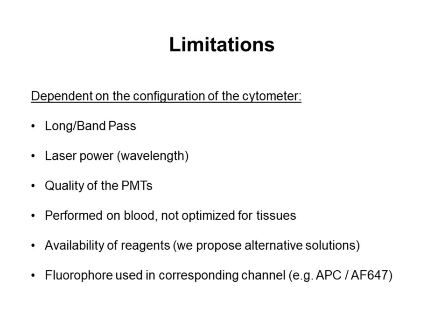So it's an advantage here. And of course, it depends on the fluorochrome you use in the corresponding channel. For instance, we use APC, but if you use a different dye, you will have to run this type of analysis and comparison again.